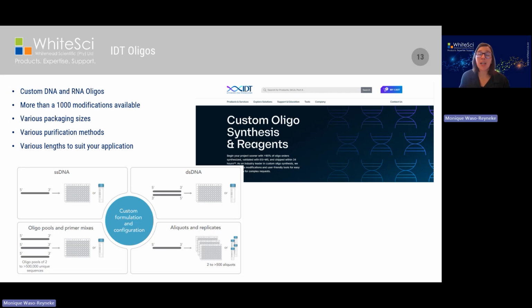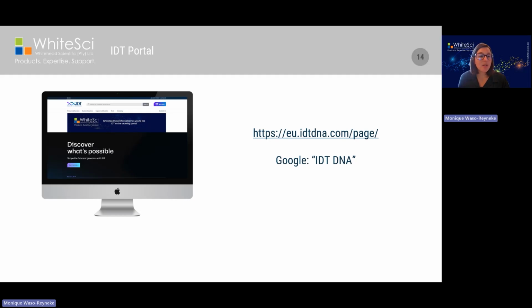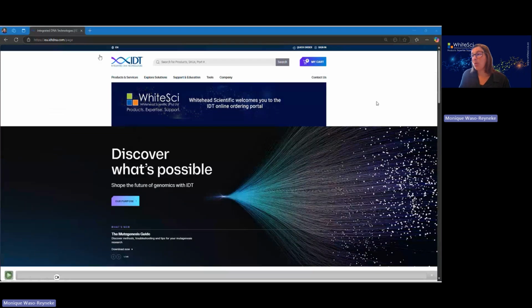Now, you may be wondering, this is a lot of information. Where do I actually go to get this information? So the first point of call is our IDT portal. So if you type in this web address or if you Google IDT DNA, you will land on this portal, and this is what it would look like on the computer screen here. And I'm going to show you a video now of how to navigate the portal and where to find some of this information. So this is what the portal would look like once you have Googled it.